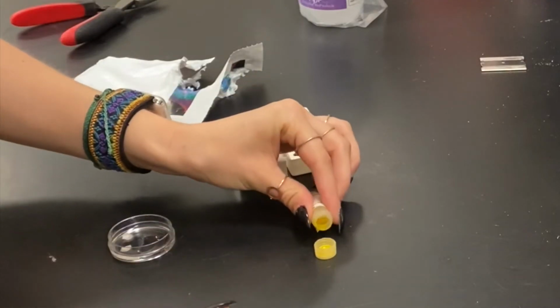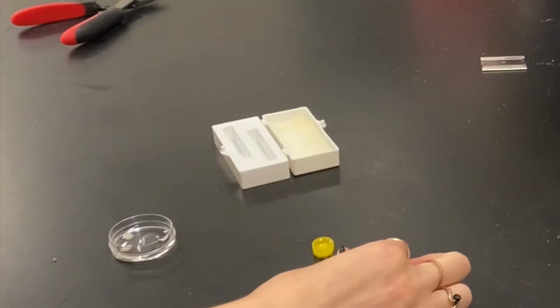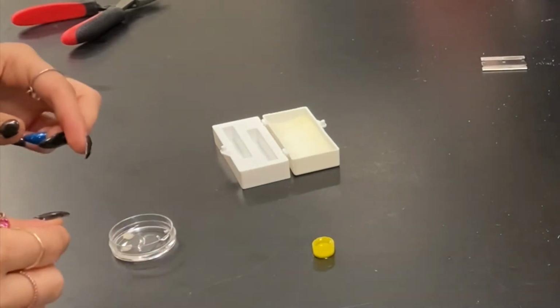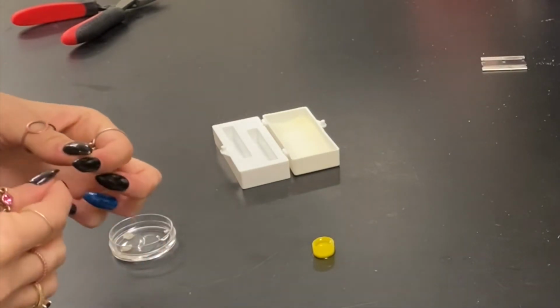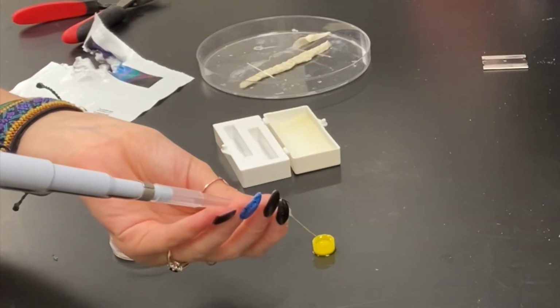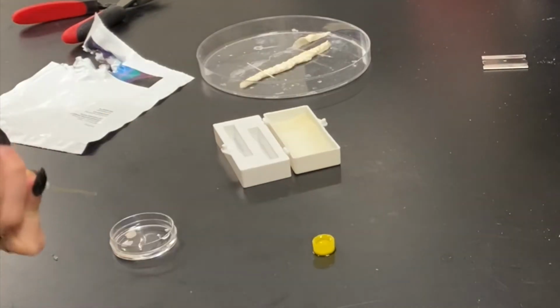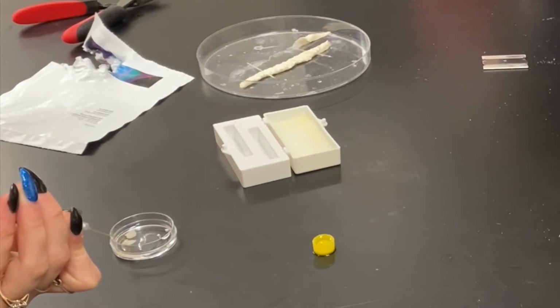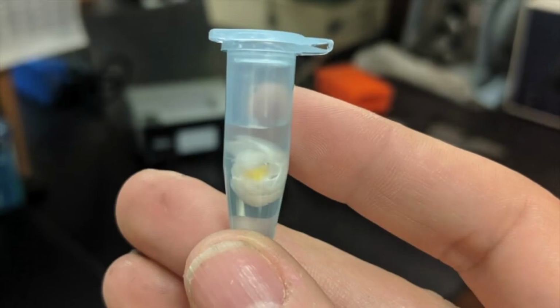I read that a single strand of hair is a good way to get a really precise application, so I started out with that, but it ended up being a pain. So I went with something that I had on hand, which was a plastic micropipette. Turns out this might have been too much and not as precise as I needed because I ended up being able to see the DiI spot with my naked eye, so I'm not sure how accurate this will be.